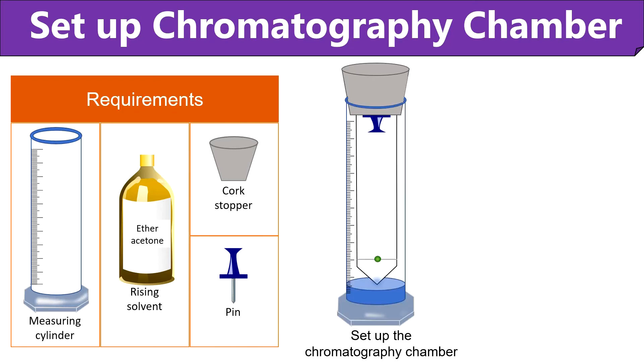To setup the chromatography chamber, add a little volume of the rising solvent to the measuring cylinder. Then bend the filter paper from the top and attach it to the cork stopper using bush pin.